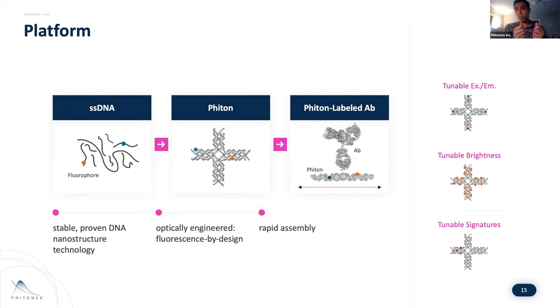It's about 20 nanometers across, so 120 kilodaltons, although that belies the fact that DNA actually has this natural curvature. What's very interesting about this, for what it's worth, is that it stabilizes all of the label interactions, right? So if you, for instance, put a tandem on one of the arms of this structure, you can stabilize it spatially and engineer down to the sub-nanometer level the way that those are interacting, right? So actually, we've done that for the six labels that we'll talk about today, and we can tune to get very, very efficient FRET, because the distance of that interaction is a critical component in the efficiency of that transfer and the efficiency of controlling the way that you'll see these things perform optically.